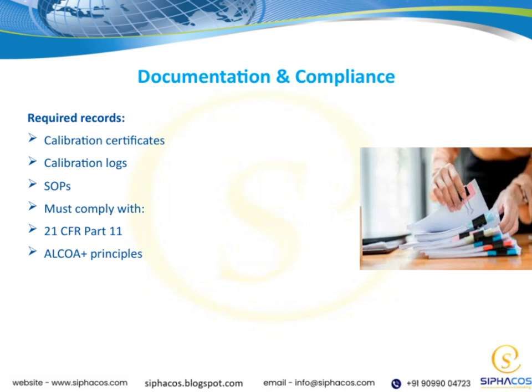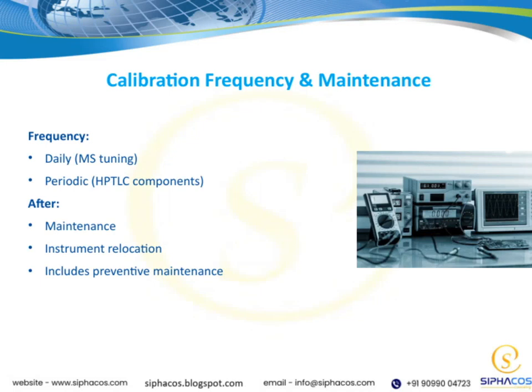Let's talk about calibration frequency and maintenance. First, the frequency of calibration is crucial to ensure our instruments are always accurate. For daily tasks like MS tuning, it's important to calibrate every day to maintain optimal performance. Then, for periodic checks, especially of HPTLC components, we perform calibration less frequently, but still regularly.